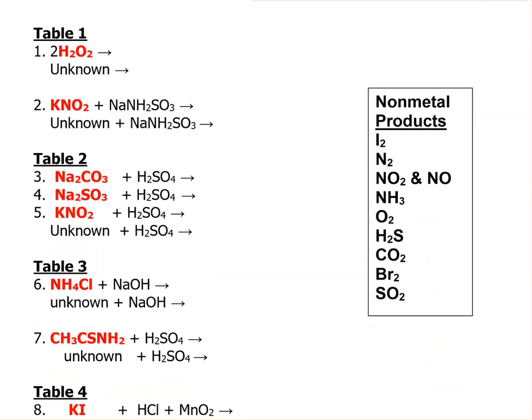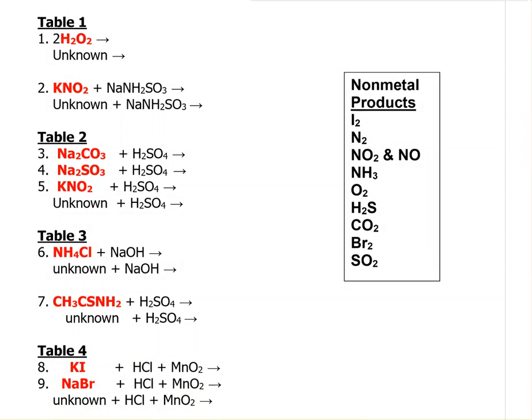Okay, so let me show you how this works. These are all of our reactions. Now, the compounds in red are knowns. They are our known reagents, and your unknown is one of those. Let's do this one. This one's pretty obvious. If you react your unknown and you get, say, a smell like rotten eggs, and then you react this one with the same sulfuric acid, and it smells like eggs, then you know your unknown is this compound, which is thioacetamide.